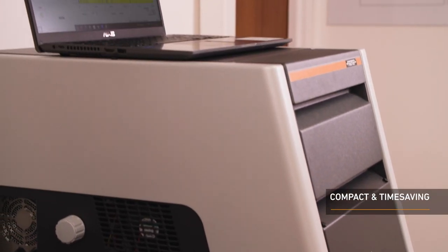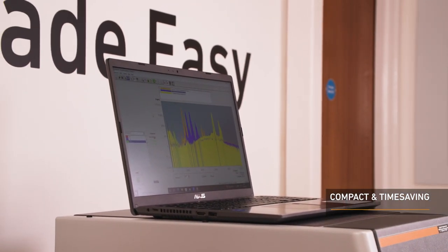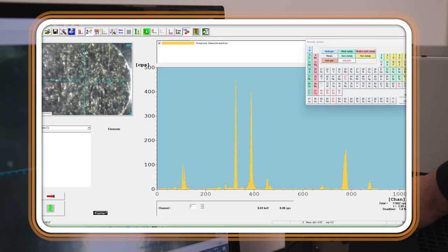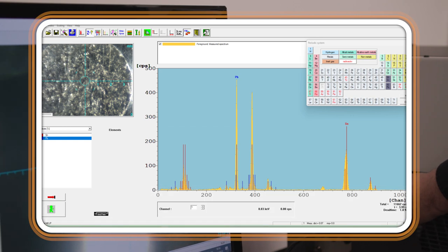The GoldScope 510 has an X-Ray beam in a time-saving bottom-up measuring direction, meaning it's compact in design. The instrument has easy-to-use software, so FischerScope users can be up and running with their measurements quickly, regardless of experience.